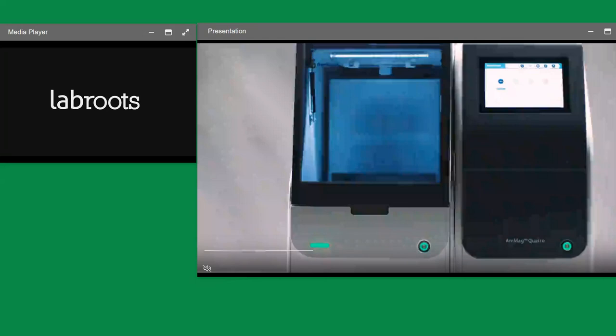Now I have a video to show you. A couple of things to highlight before the video: the Quattro is equipped with scanning to enable seamless loading, and it is also equipped with puncturing tools so that when you load your consumable onto the deck it is completely enclosed and maintained, with no potential for cross-contamination. The system is also equipped with index mixers, which enable really good binding of the plasmid DNA and ensure the plasmid is mixed well and cleaned up properly for a very clean, seamless process.